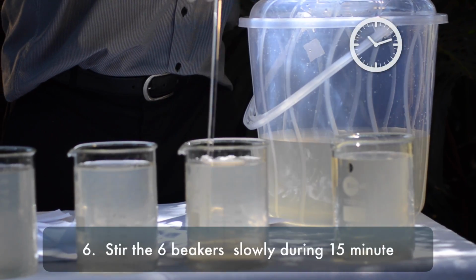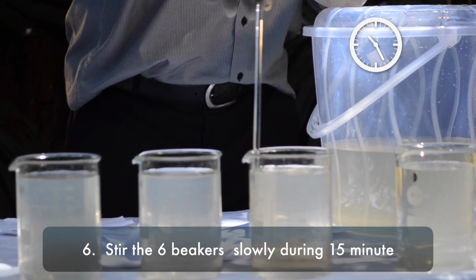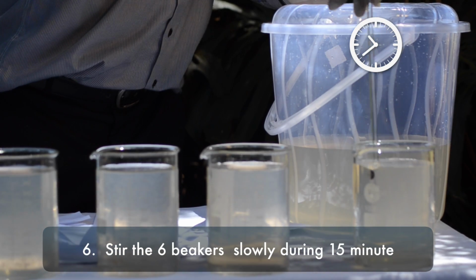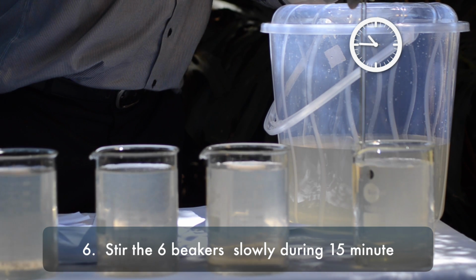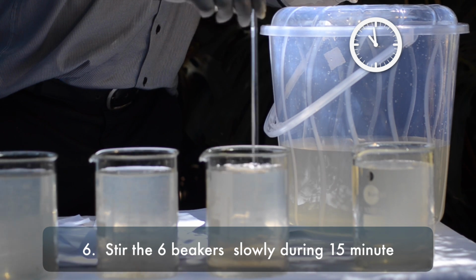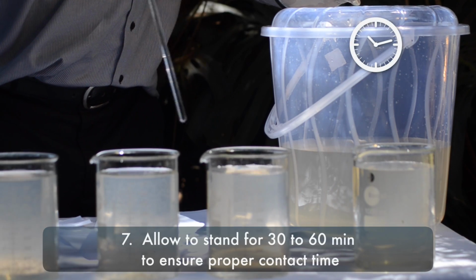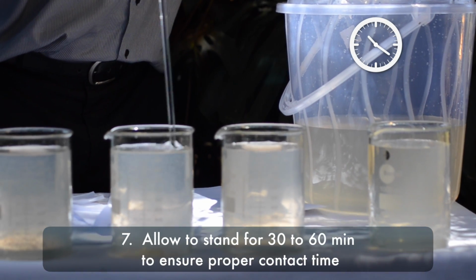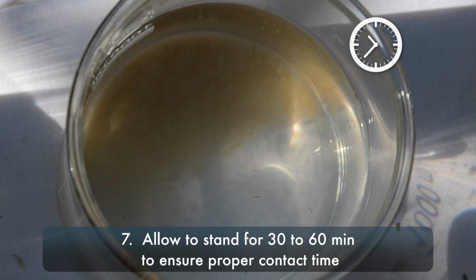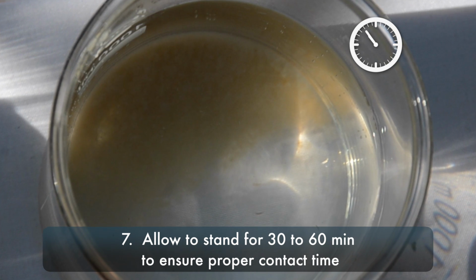Once we stir for 1 minute, the next step is to stir slowly for 15 minutes to ensure that the aluminium sulfate mixes with the suspended materials in a process called flocculation. After stirring for 15 minutes, allow a period of between 30 to 60 minutes for contact time of aluminium sulfate and the suspended materials to come together and settle down.